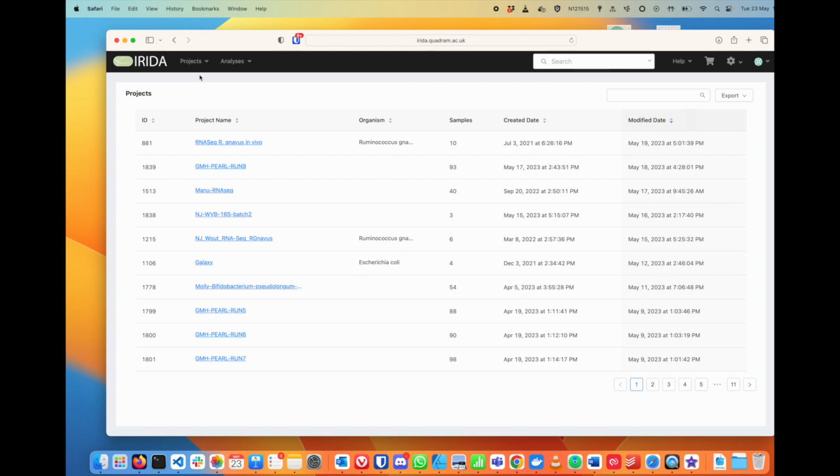The system has a hierarchical structure. A project is a container for samples, and each sample can contain one or more sequencing files. We try to simplify this structure, associating to each sample only the output of a sequencing run. So a sample can usually have one file for nanopore or single-end Illumina sequencing, or two files for paired-end Illumina sequencing. Occasionally you might have more, but ensure this is expected.